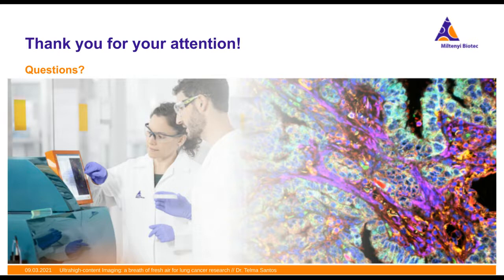What will take more time is to define what you want. Once that is done, it's quite fast. The software is fast, and depending on how big your data set is, your computer can be a bit faster or not. But in general, for sure, it's really fast. So the image there of the distances was generated in 3 seconds.